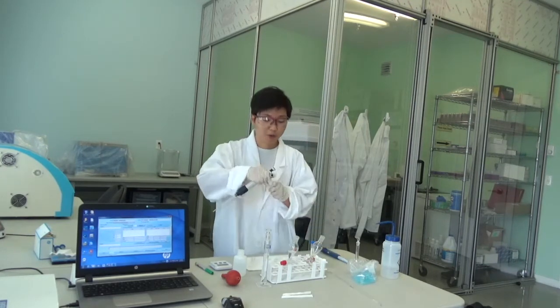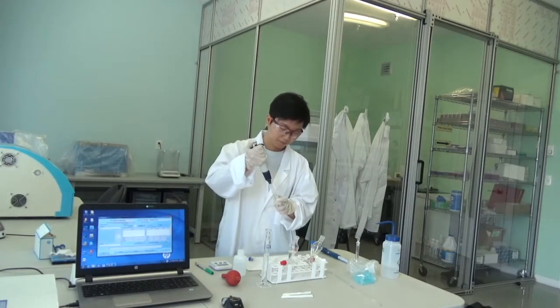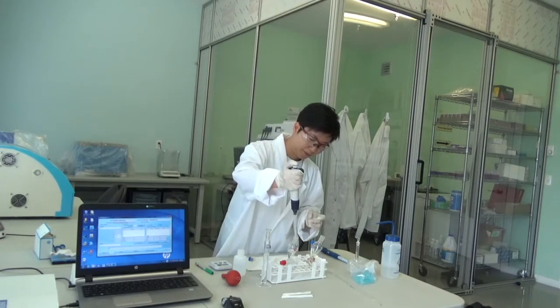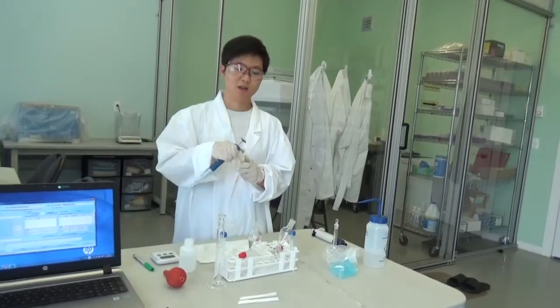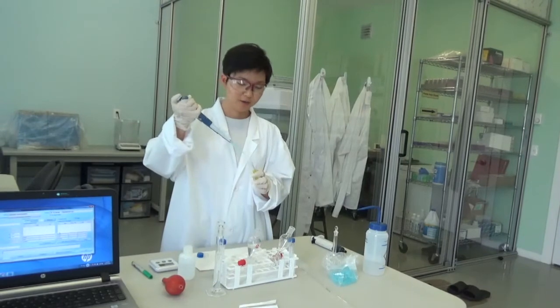And then add 4 ml of water. And then you need to add 1 ml of acridine yellow dye.